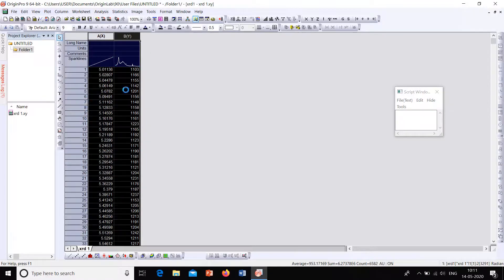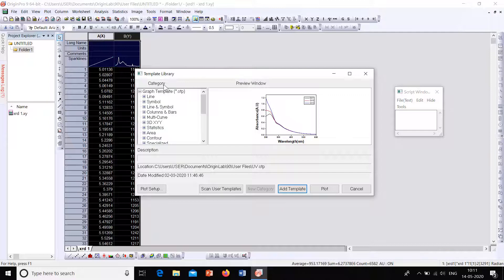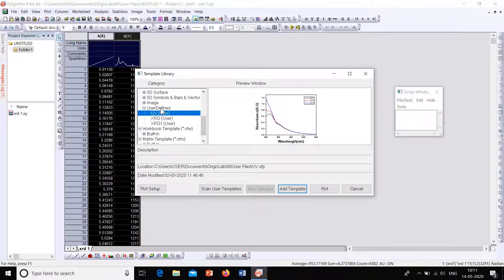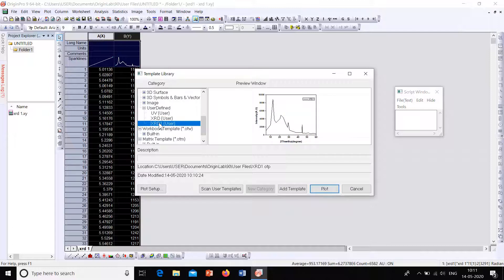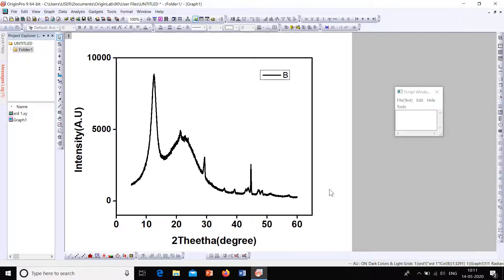Now using the template: select the data, go to Plot, and there is an option called 'Template Library'. From the Template Library, select the category 'User Defined' where we saved our template 'XRD 1'. Select 'XRD 1' and click Plot. You can see that all the formatting we saved is already applied — a beautiful graph, just like before. This is how you save a template and use it for future plots.